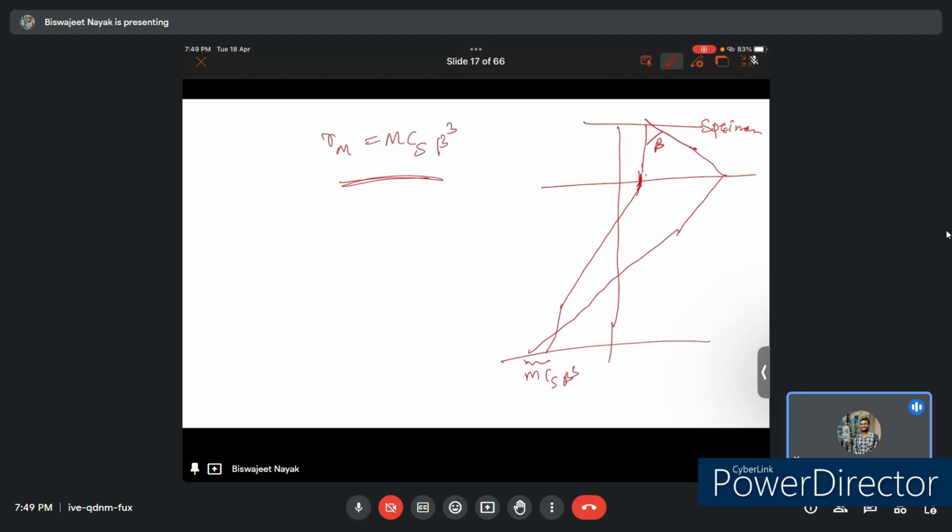So the area we select using the SAD aperture corresponds to areas here, PP1, the object plane.